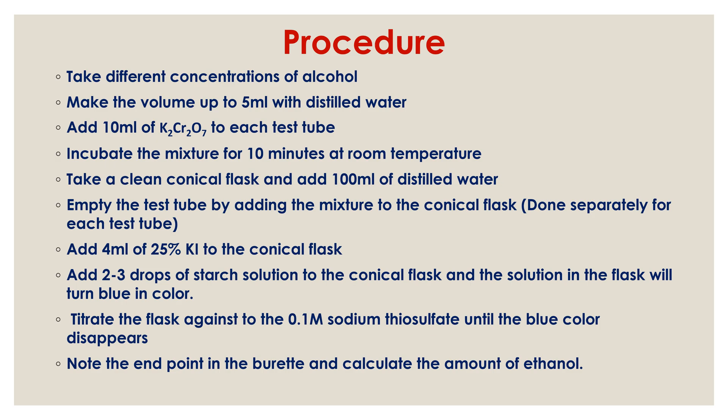Add alcohol at different concentrations to the test tubes and make the volume up to 5 ml with distilled water. So every test tube now has 5 ml of solution. Then add 10 ml of potassium dichromate solution to each test tube. Incubate the mixture for 10 minutes at room temperature.